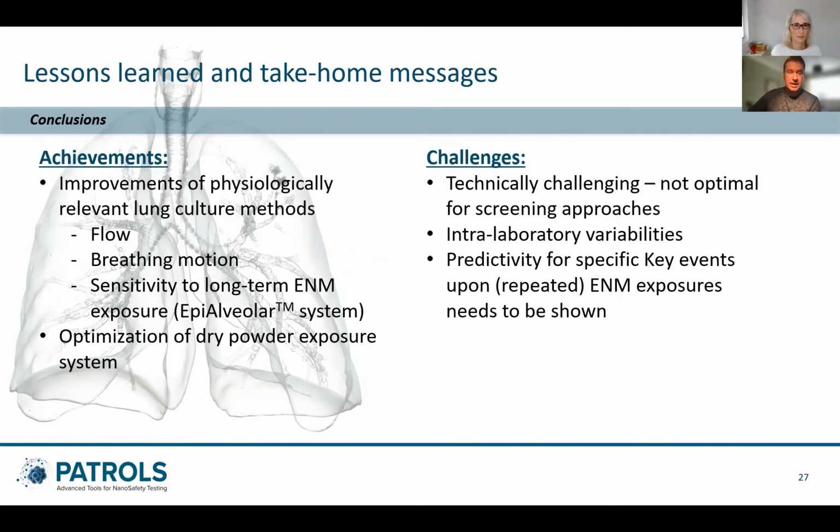In addition, when we're putting together the different model systems, we found that beyond the static controls, being able to use physiologically relevant culture methods, such as fluid flow, dynamic breathing, and also just using more primary cells, so that we can enable long-term ENM exposure, have been highly advantageous and are a key output from this work package within PATROLS. In addition, the ability to expose cells at the air-liquid interface to dry powder scenarios has been a key and impactful study and output moving forward.